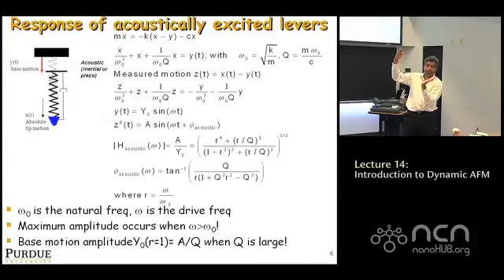Remember, what it's doing is trying to measure how the reflected spot on the photodiode moves up and down. If you do the trigonometry and move just the cantilever in parallel up and down, the motion of the spot is effectively negligible. If this moves up and down 10 nanometers, the distances in the laser path are microns or millimeters, so you get hardly any motion in the spot. On the other hand, if you rotate it, you get a huge amplification of the rotational motion or bending, and it causes a big motion in the spot location, okay? So it's a very subtle point, but I hope you've picked up on it: in an AFM, what we measure is the bending angle of the cantilever. We always try to connect that to the tip motion, so we always make an indirect measurement of tip motion. What we measure is only the bending angle, okay?